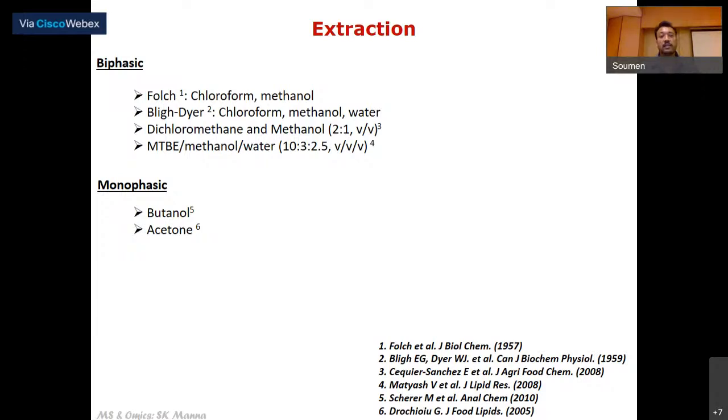So therefore, when you are trying to take out the lipid, you have to really push through the aqueous layer and then take the organic layer. In case of MTBE, because this is a light, low density ether, that ether layer floats over the aqueous layer. So it is very easy to take the organic layer out and process it.